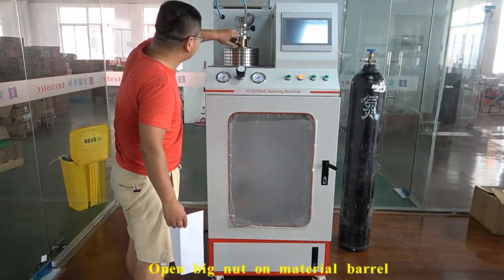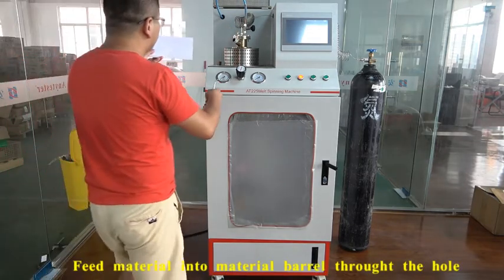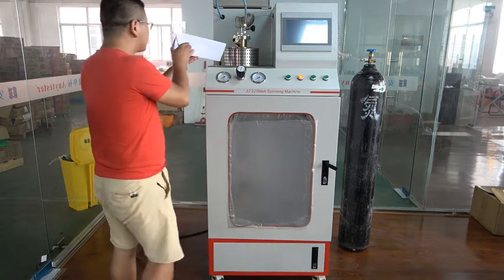Open the big knob. Now take the material into the material barrel through the hole.